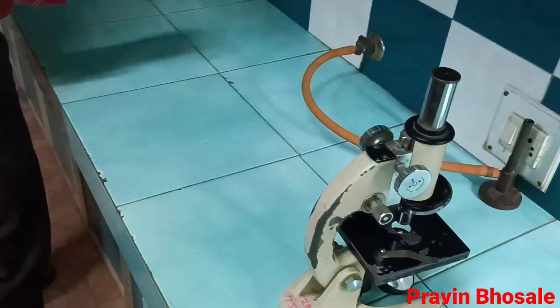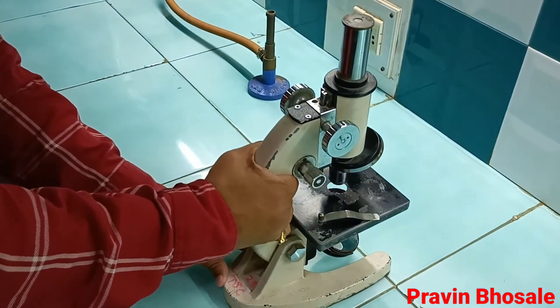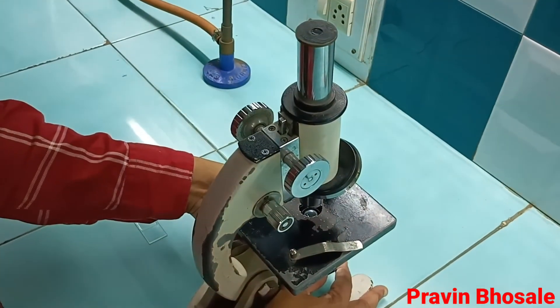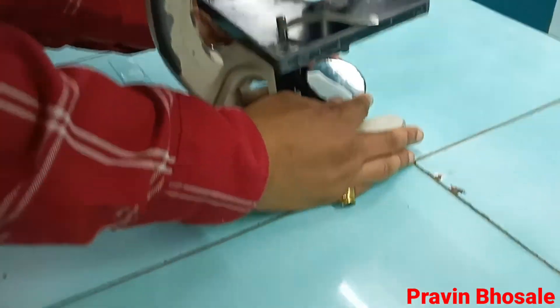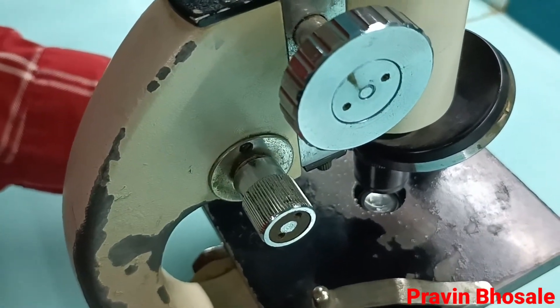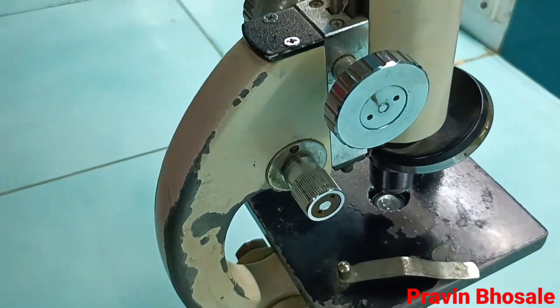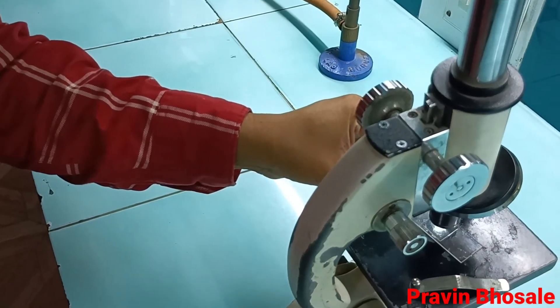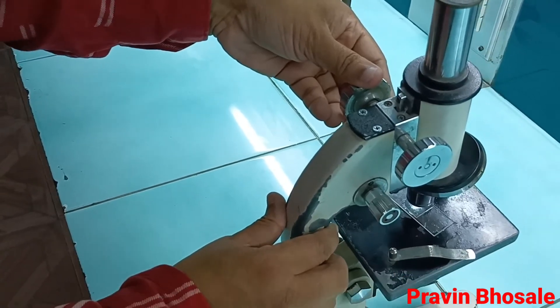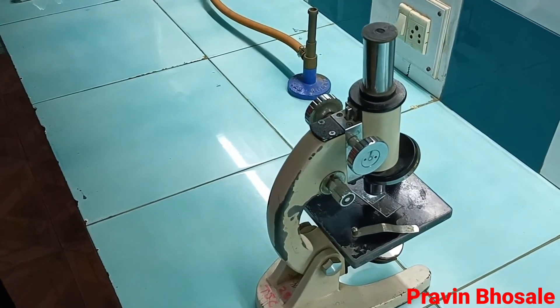First of all, I am adjusting the microscope — adjusting the mirror. This is the aperture, and below is the mirror. I am adjusting the light. You can see the light in the aperture. The lens objective should be 10x — you are observing under low power. Now place the slide, keeping minimum distance between the object and the objective lens.